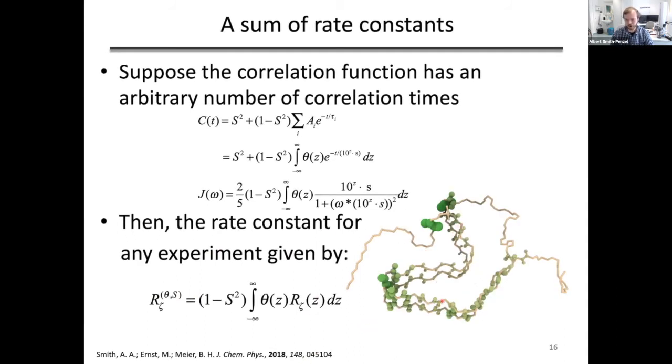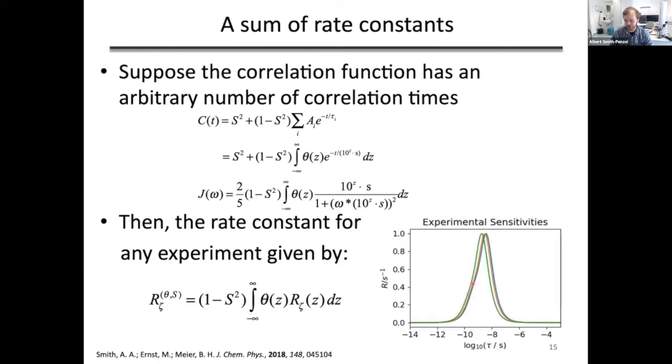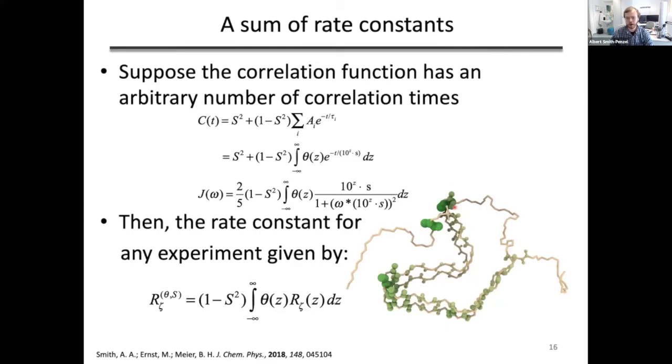This is R1 at 850 megahertz, measured for HET-s fibrils, and it's measured on the nitrogen. And so you can see basically how the amplitude, and this is going to be roughly around 1 nanosecond, although it's going to span the whole breadth of this window, varies throughout the HET-s fibrillar structure.